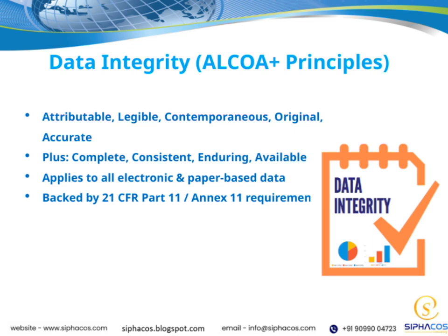Legible ensures that data is readable and understandable, which is essential for audits and reviews. Contemporaneous refers to recording data at the time the activity occurs, capturing it accurately and promptly. Original indicates that we keep the initial record, the first documentation of the data, not just copies. And accurate underscores the importance of data being correct and free from errors.